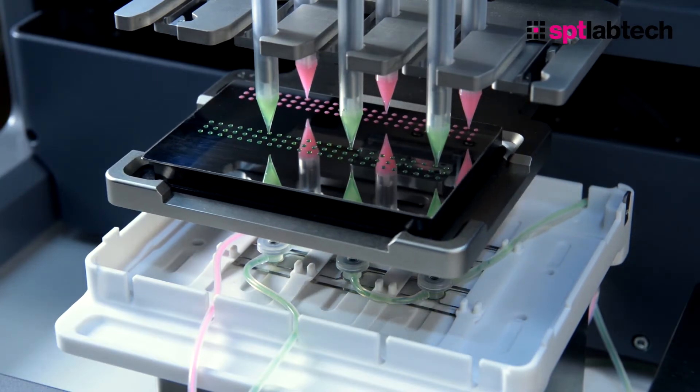Multiple aspirations can be taken to run multiple plates, so for high throughput screening it opens up the possibilities to do hundreds of plates in a screening run without any human intervention.